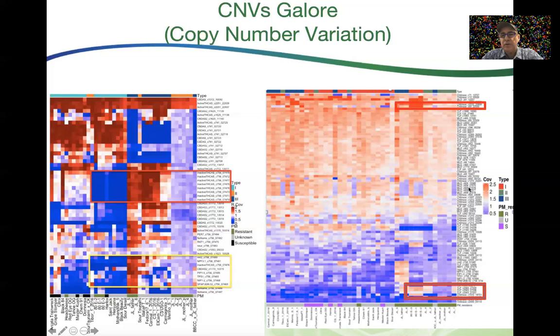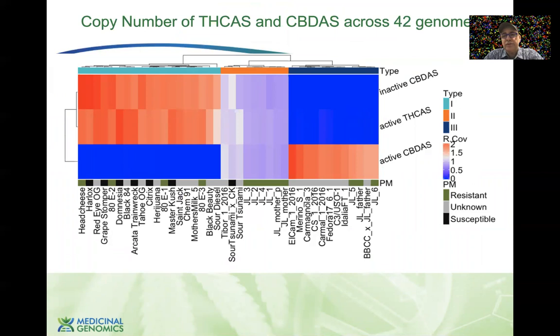We're just looking at copy number variation here as well to see if there's anything striking that stands out. We haven't gone deep into the single nucleotide variation level yet. We're just looking at copy number. And you can actively see some of these copy number changes that are governing the cannabinoid content. This one is quite well known as the BT/BD allele. It had never been previously described as to where it was in the genome until this preprint came out. But now it's pretty obvious that this is a copy number change: your plant either has a complete deletion of the active CBDA synthase, or it has an active form of THC synthase, and it has one or the other. Sometimes it can have both, like you have here in the middle, and those are type 2 plants. If you're a type 1 plant, you have an active THC synthase and you don't have an active CBD synthase. If you're a type 3 plant, you can make CBD synthase and you can't make THC synthase. And if you're type 2, you can make both. We have seen some single nucleotide polymorphisms that also mimic this, but this is by far the dominant pattern that we see across the genetics.